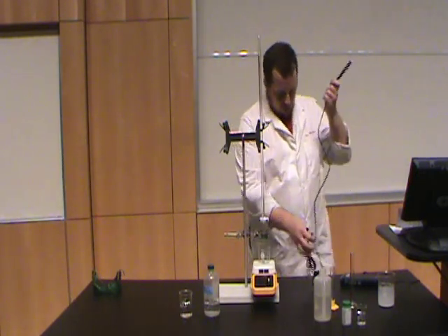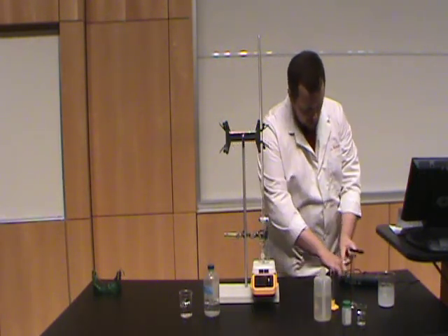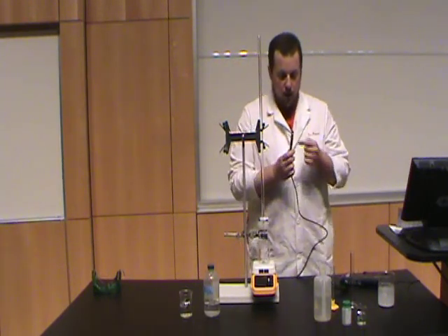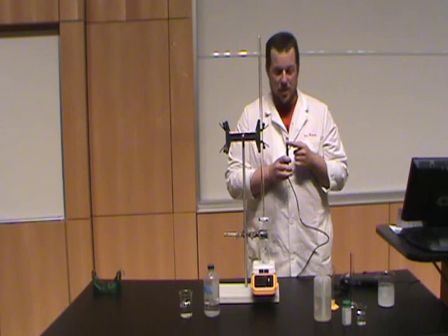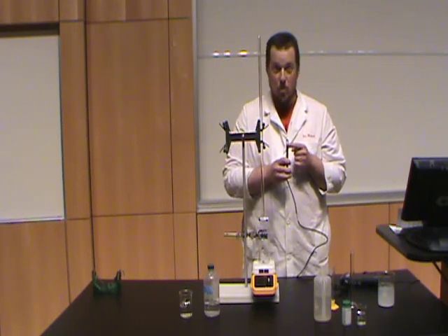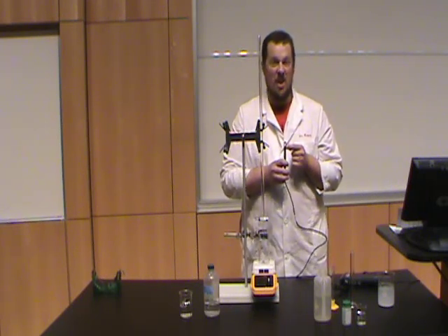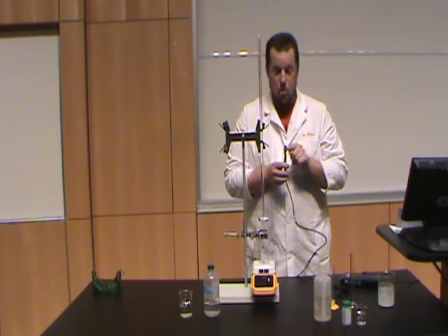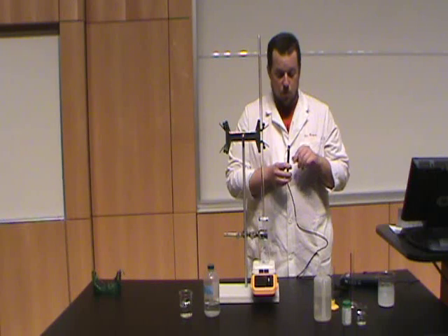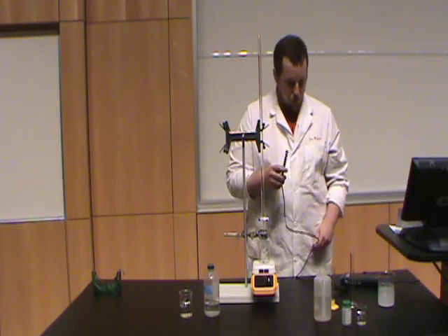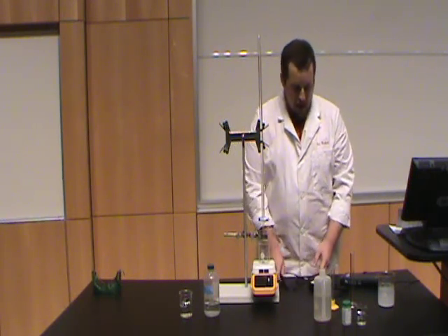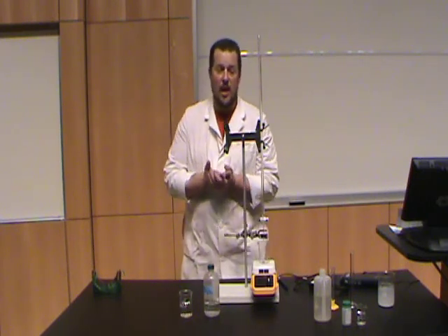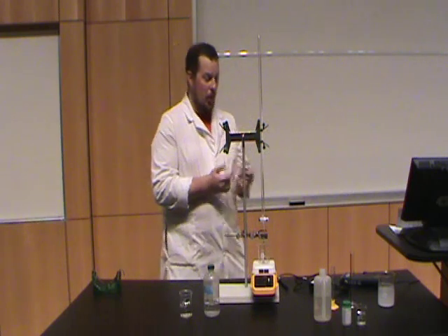Let me hook up one of these conductivity probes. Really, the inside of this conductivity probe isn't a whole lot more sophisticated than our light bulb with two wires hanging off of it — it really is just two electrodes that sample the solution we're looking at. As with any instrument that we use, the first thing we have to do is calibrate it to make sure that it's set correctly.